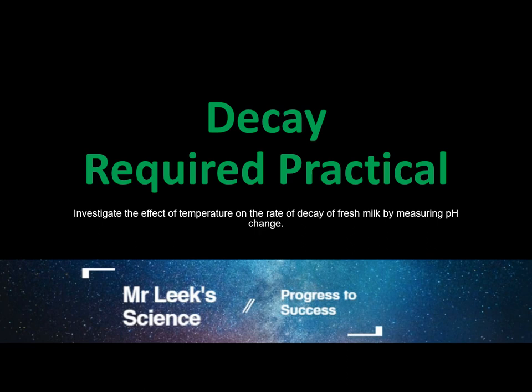This is one of the biology triple science required practicals, the decay one. The point of this is to investigate the effect of temperature on the rate of decay of fresh milk by measuring the pH.